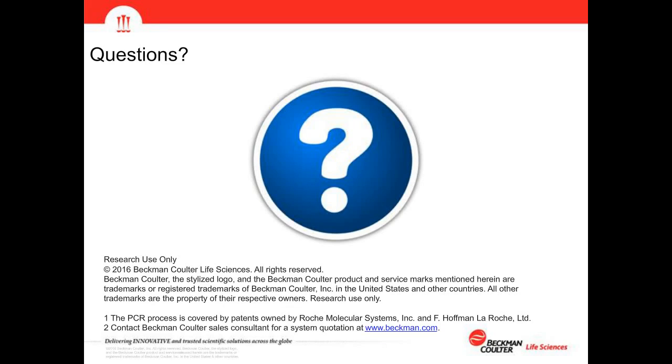Yes, absolutely. Probably not in this Q&A session because it's really down to the detail. So if that user is willing to give their contact details, we'll definitely be in contact with them, because the first step to a successful automation really is a very good understanding of that process, and again, in all detail, because in the end, it is the detail that will make the difference between a successful automation and not. So high level, yes, we can do that.